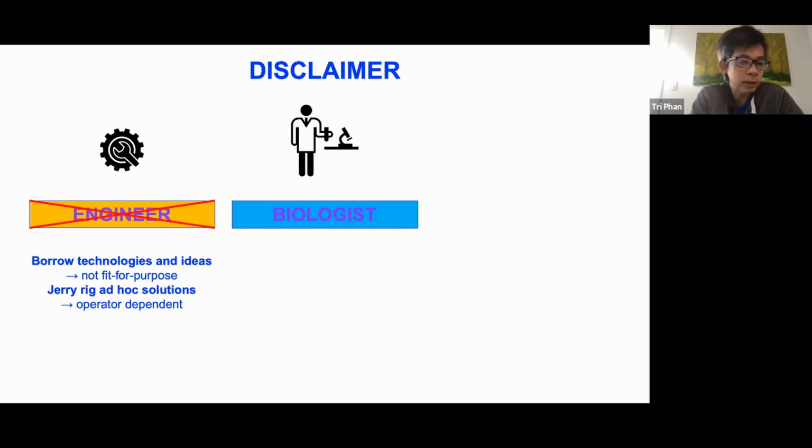But also, because I'm not an engineer, quite often we have to jerry-rig ad hoc solutions and troubleshoot the way we do our intravital experiments. As a consequence, quite often the solutions can be unique to the individual. One of the things that we're looking towards developing are robust methods that are really independent of the operator, so that anybody can come in off the street and be able to do the experiments.